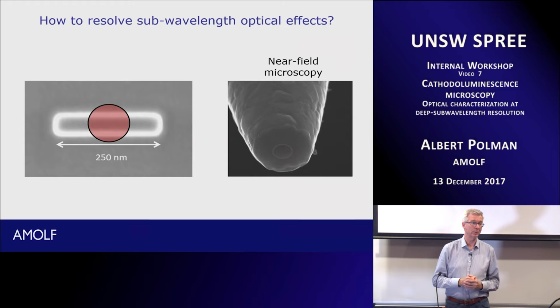And there are lots of problems. You can imagine these tips are hard to make and they will break, and the tip actually affects the measurement. So it's a very interesting technique, for sure, but it also has its limitations, certainly in spatial resolution.